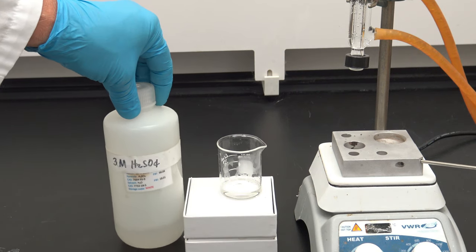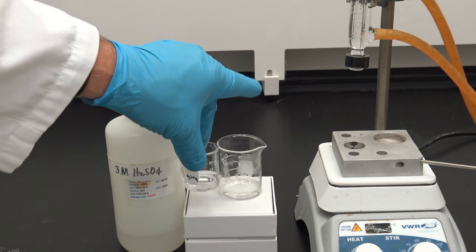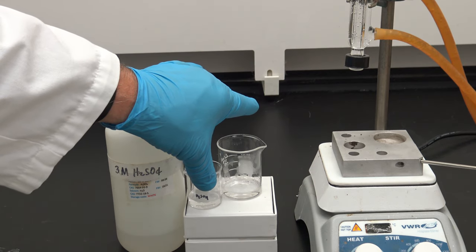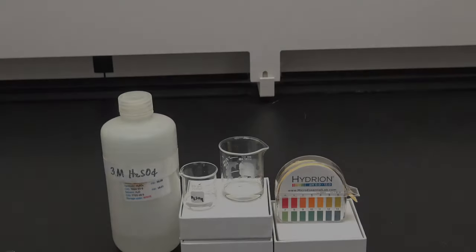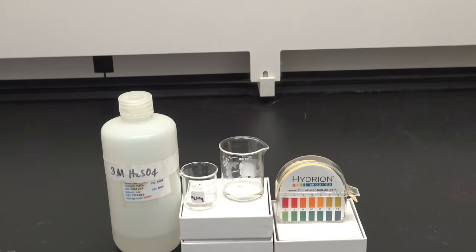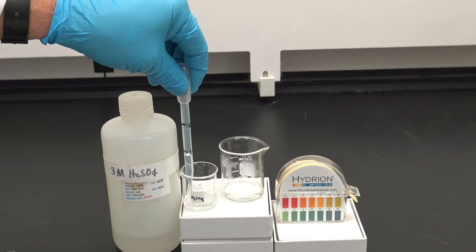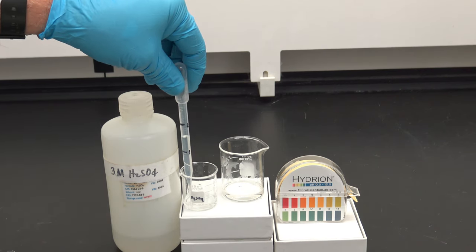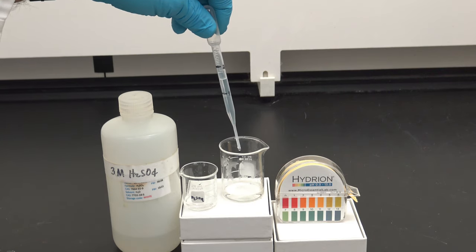Now, I'm going to acidify my solution using some sulfuric acid. I'm going to first go in and take up about 2 milliliters of sulfuric acid. And then I'm going to add it dropwise here.